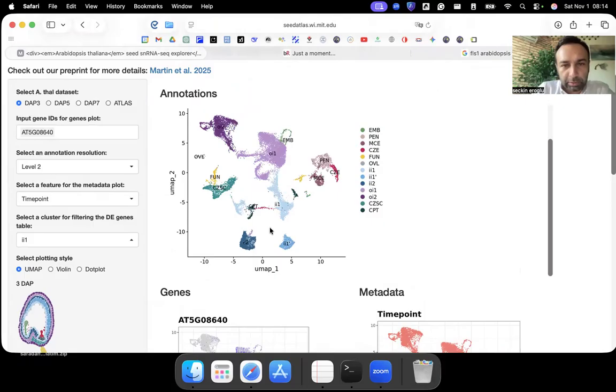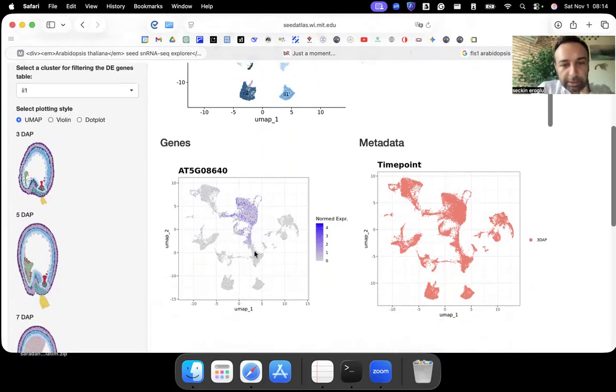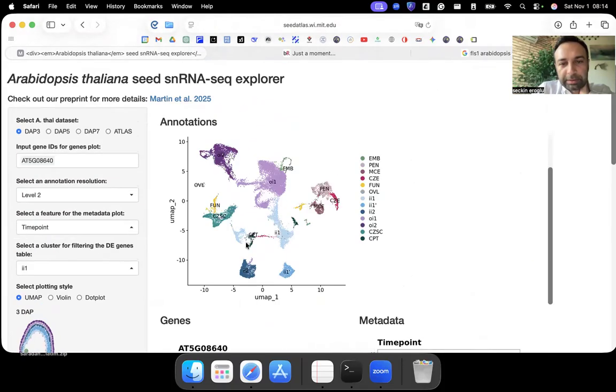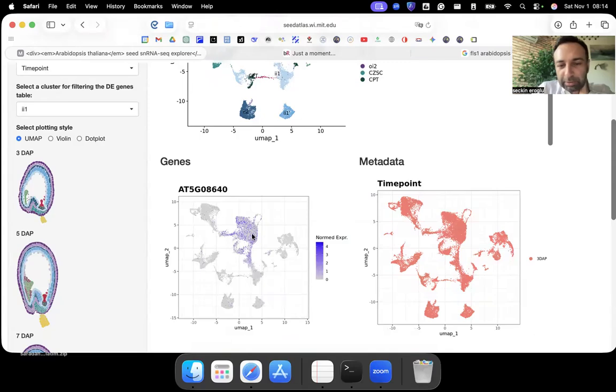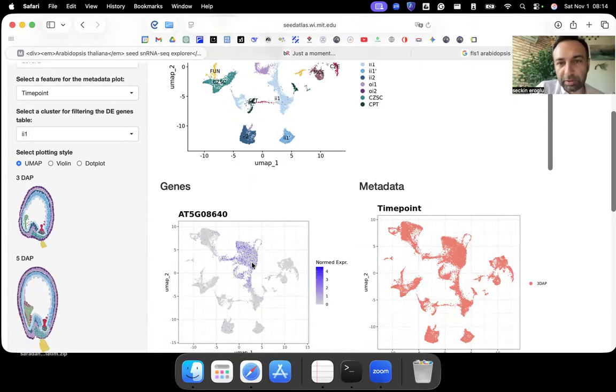Okay, so this didn't change when I put my gene. And here, what it shows is where the gene is expressed. So this is mirroring this. And wherever you see spots, it means in these cells, the RNA sequencing result of these cells, the gene expression is very high, which means the gene is most expressed in OE1, almost exclusively.